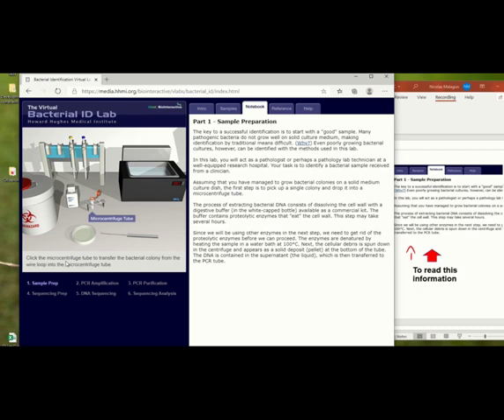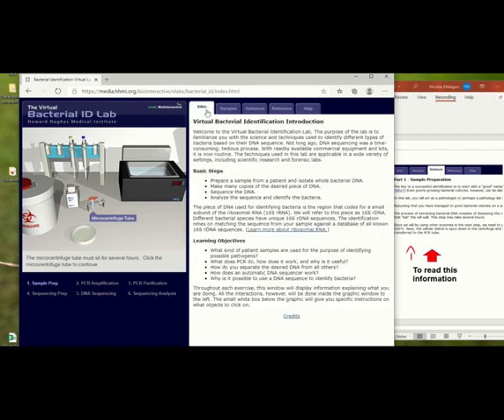Now click on the microcentrifuge tube to transfer the bacteria from the colony wire loop into the microcentrifuge tube. So here, and now placing the bacteria, you have successfully placed the bacteria. Click on the yellow micropipette. Then you go here and you are moving from one side to the other side. I recommend you keep reading all this information.